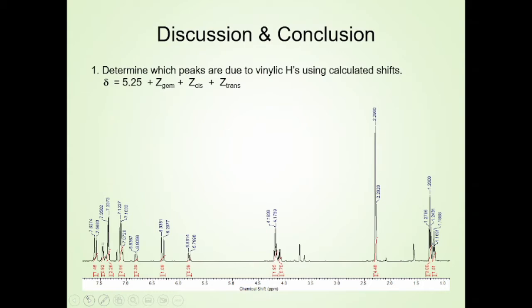calculations. And then once you have that for the two hydrogens on the trans and the two hydrogens on the cis, you'll see which peaks they match up with. And that will help you identify those. And then you can also determine which is the major and which is the minor. And of course, we want to confirm that cis-trans assignment. And for that, you will be using what? What did you do before for cis and trans? Remember?